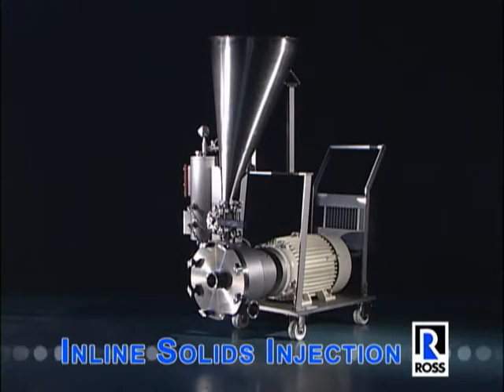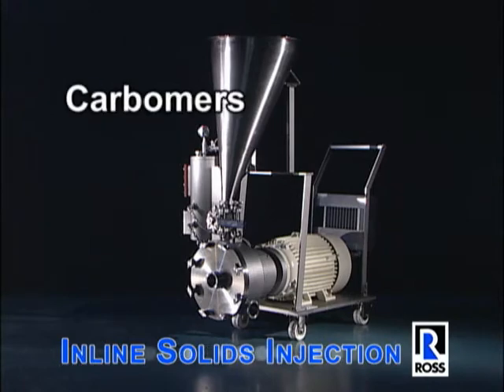The Ross Inline Solids Injection System is great for inducting and immediately dispersing large quantities of difficult to disperse powders, such as CMC, fumed silica, and carbomers.